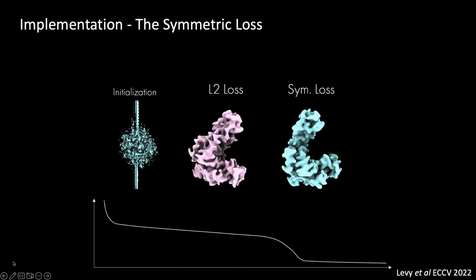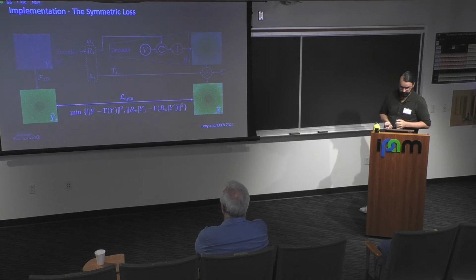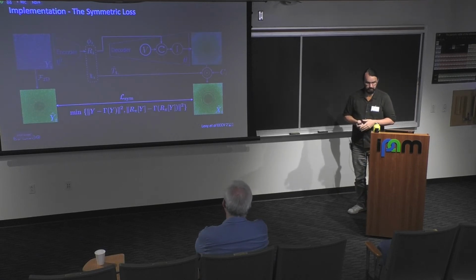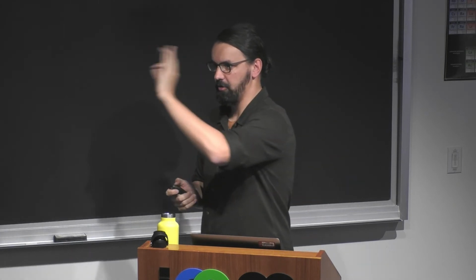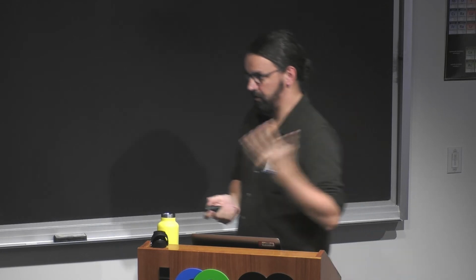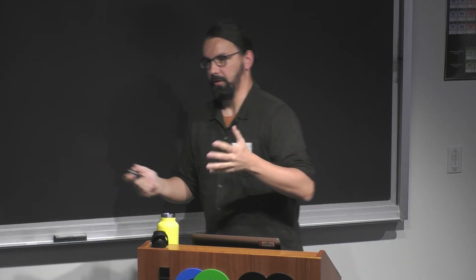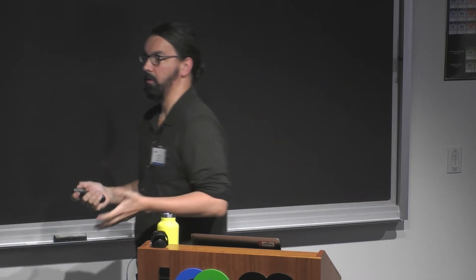Okay, so another idea in this paper was how do you represent the volume, right? Traditionally, in Cryo-EM, we think of volumes as 3D maps with voxel values, like electrostatic potential intensity at given voxels. CryoDRGN popularized neural net representation of volumes, and that showed the power of that.